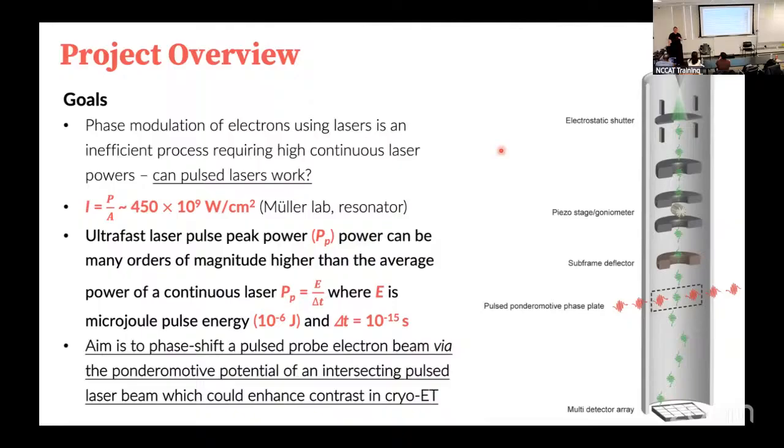The problem with using a physical material is that, in Radostin's case, what he's doing is putting a piece of very thin carbon into the back focal plane, and then he's heating it up. So the back focal plane is where the beam is coming in, and basically it's at its finest point. You're having a focal point there. And he's heating up the carbon. It's releasing a little plume of electrons by heating it. And so that is your very, very small electromagnetic field that allows you to change the phase of the electron beam.